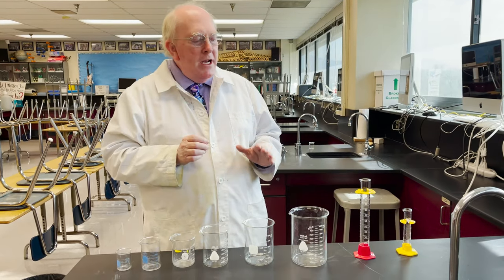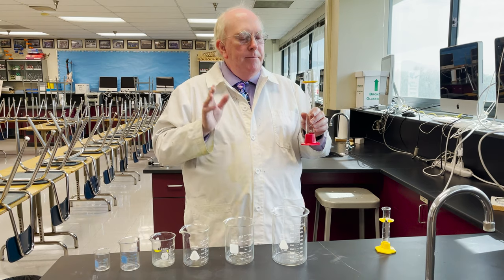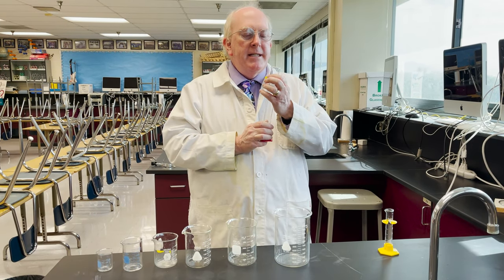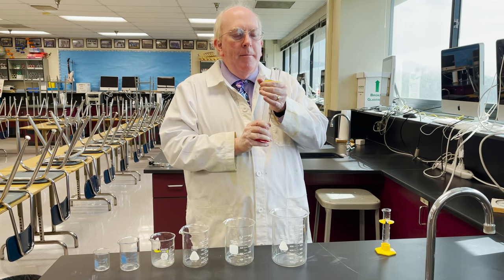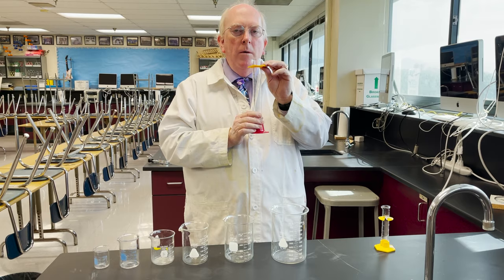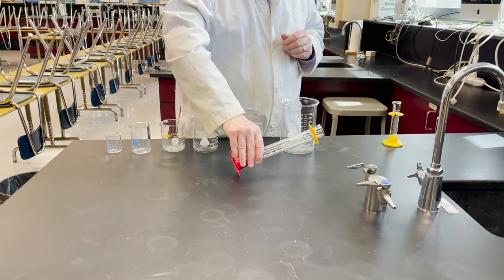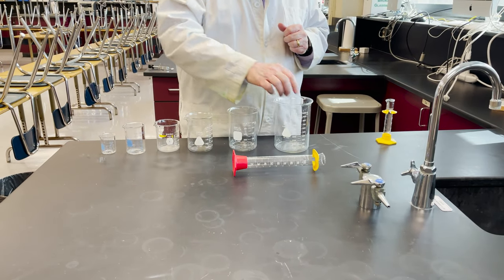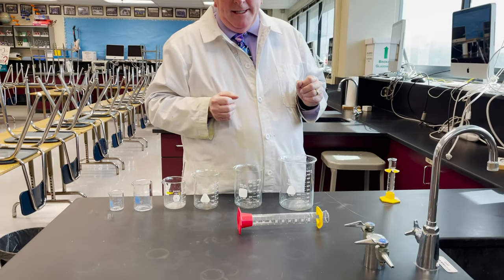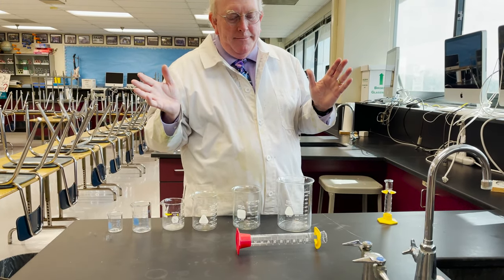If you want to measure a liquid, we go to a graduated cylinder. Important to understand — students often see graduated cylinders with these rings on them, and their first thought is that these rings are involved somehow in measurement. They're not. The ring is just a shock absorber, so that if this is on its side, the glass doesn't hit and it's not going to break as easily.